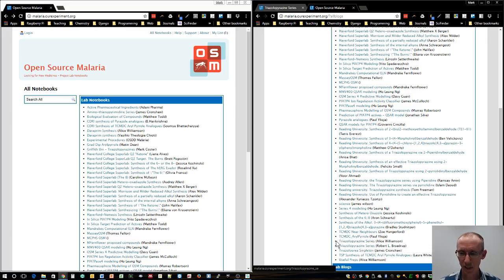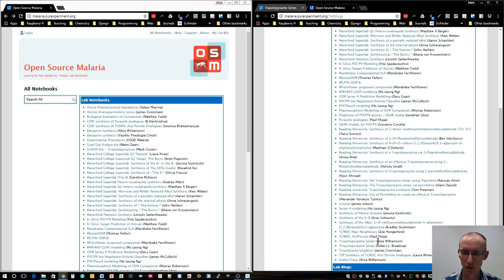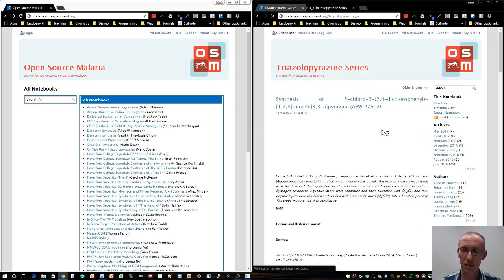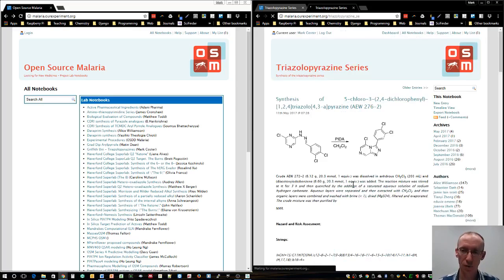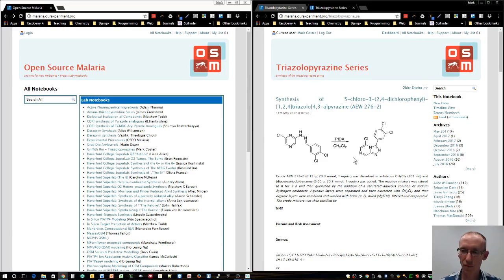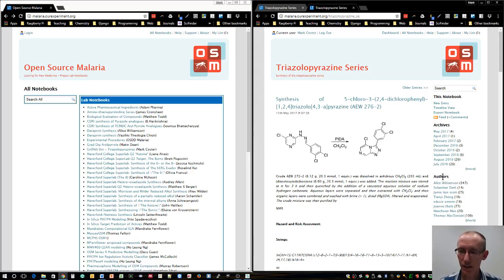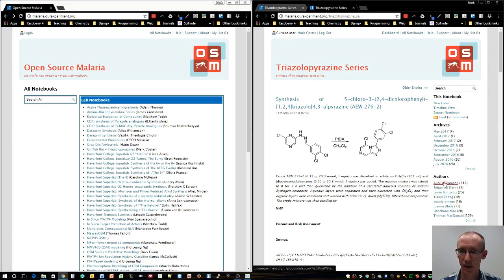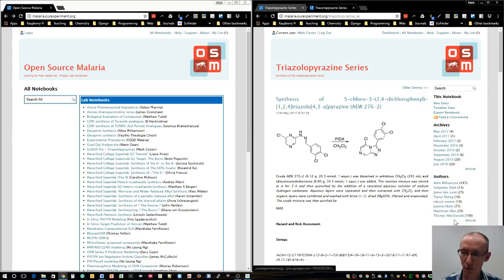If you follow this link for the triazolopyrazine series, which was started by Alice Williamson, you'll see all of the lab notebook entries for the groups working on that. You can see the list of authors and see that there have been some major contributors like Alice and other students.